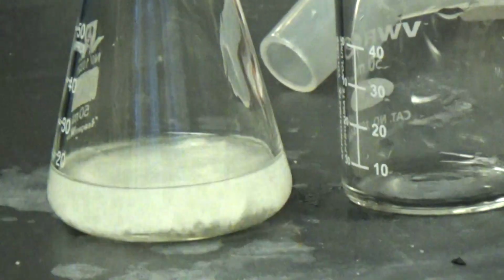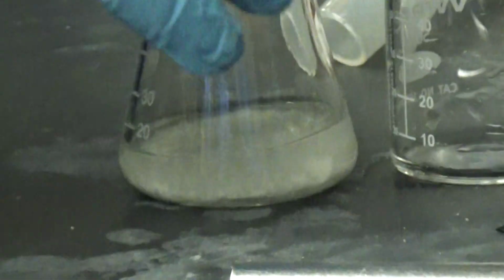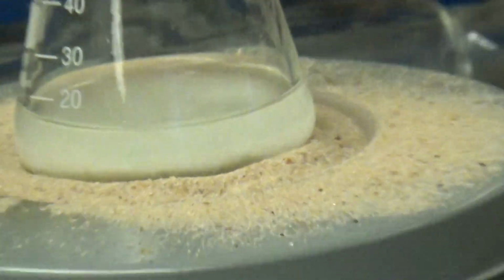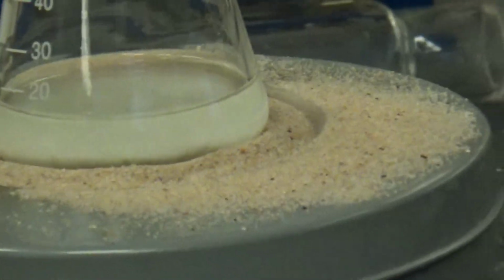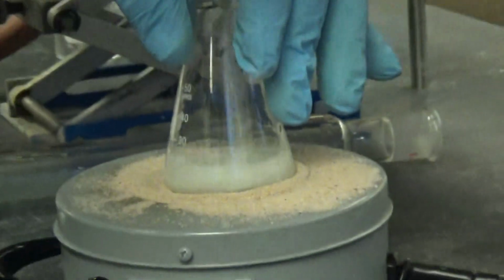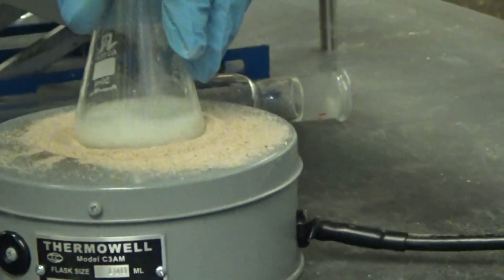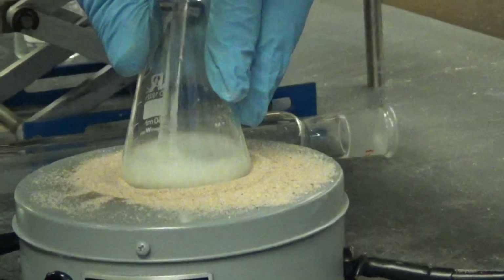Cool. So it's 10 milliliters suspended in there. Now you can go to the hot plate. You're going to cook it up till it dissolves. So this is the recrystallization.